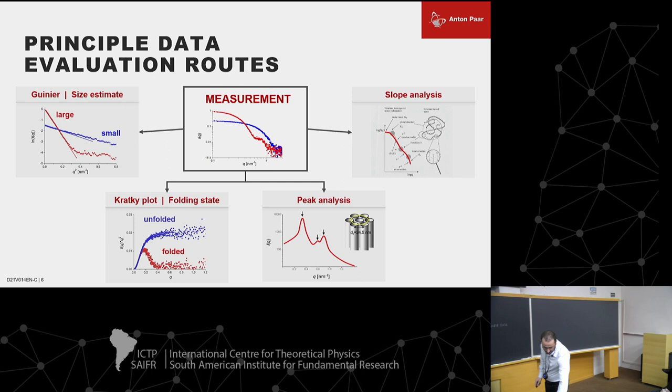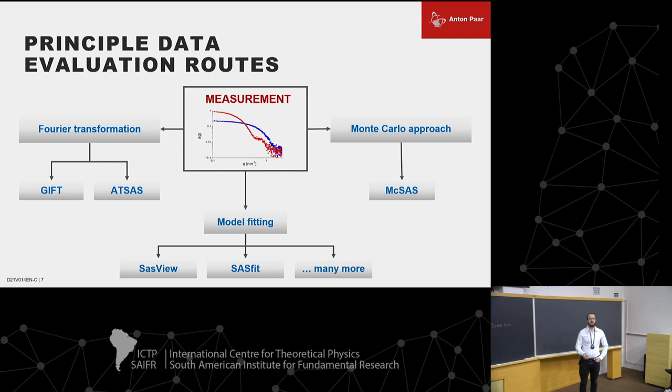Besides that, we have more applied calculations that are normally refinements done after the initial analysis, where we can use the Fourier transformation, model fitting, and the Monte Carlo approach, each of which has its own software. One of the most used is ATSAS, for example, where we can create a three-dimensional image of the particle, of the material we are analyzing, right?